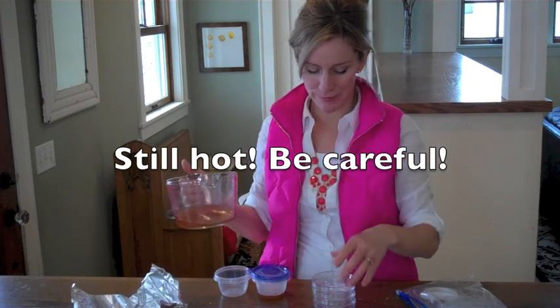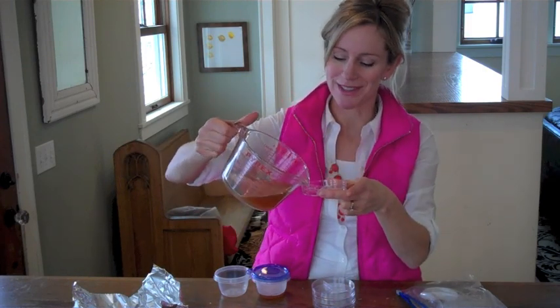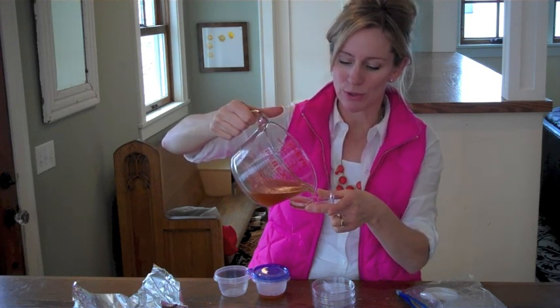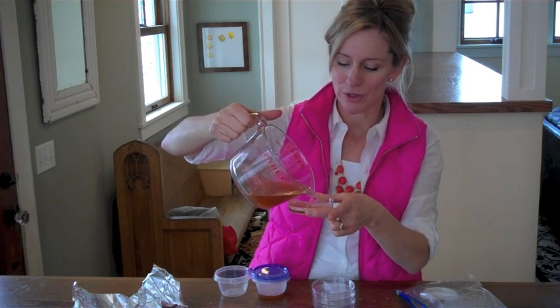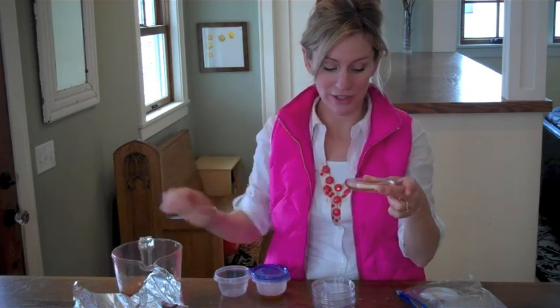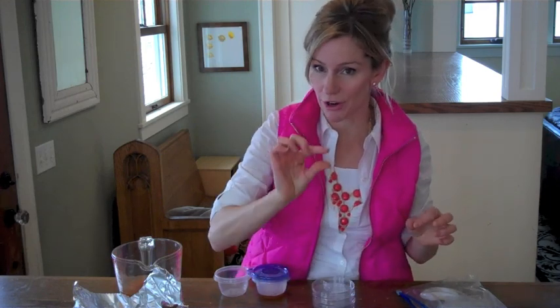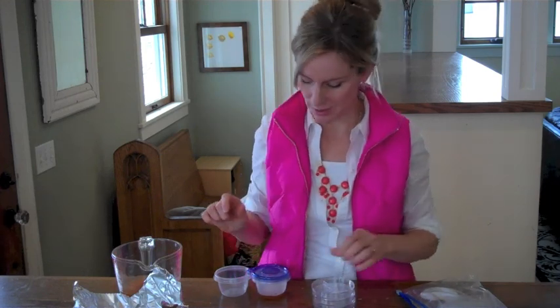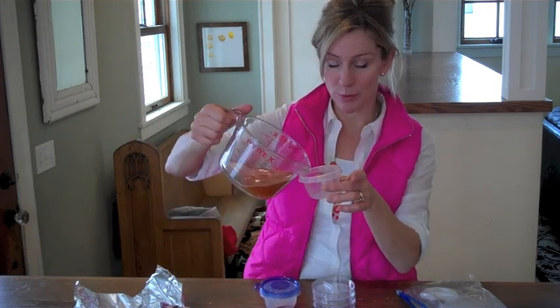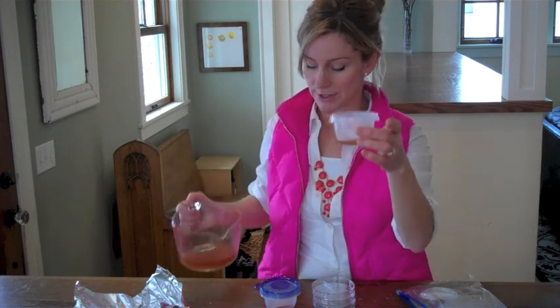Remove the cover and take your petri dishes — these are sections so I have to pour three times — and pour in about an eighth to a quarter of an inch of growth medium. Then you want to be sure to cover your plate and set it down to cool, and the gelatin or agar will harden and you'll end up with a jello-like substance. You can also use Tupperware or plastic ware — just pour in some growth medium.